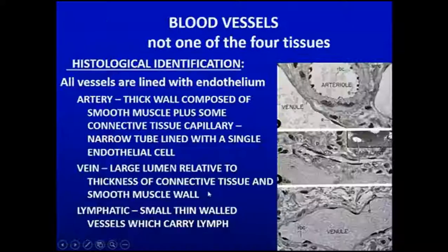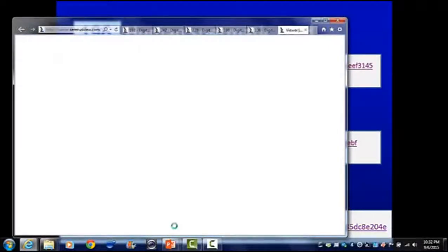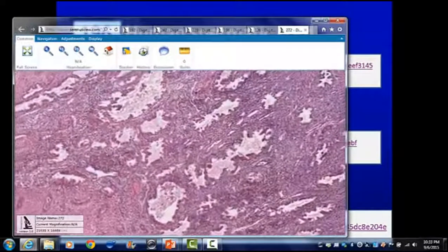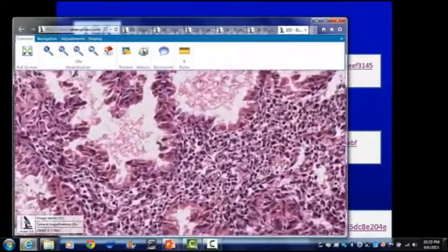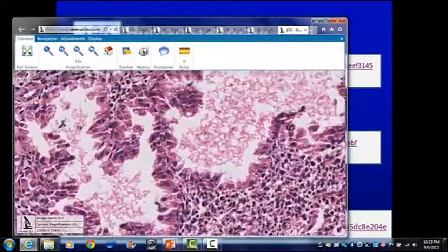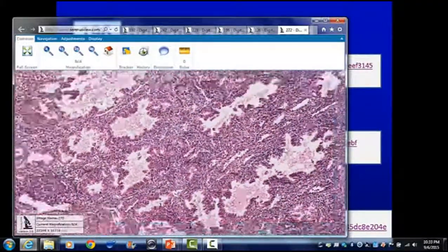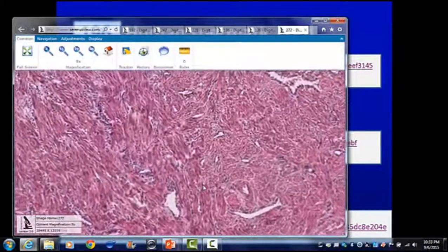And then if we looked at the human uterus, we can look at that right quick. We can see glands that are there, and again that's epithelium, and we see lots of lymphatic cells in through there, which is quite often we can see that, but a lot of fibroblasts in through there, and we also see muscle. So this is smooth muscle.